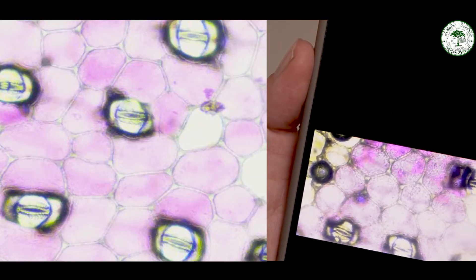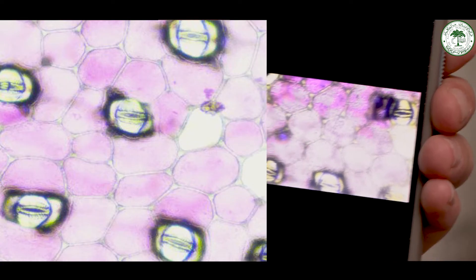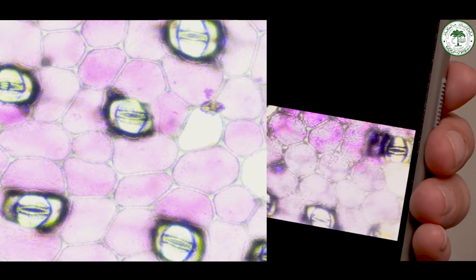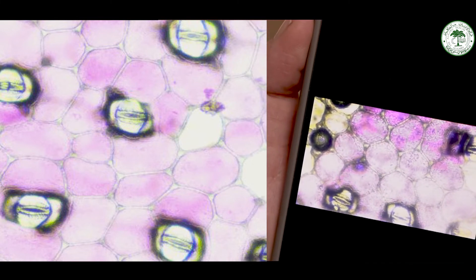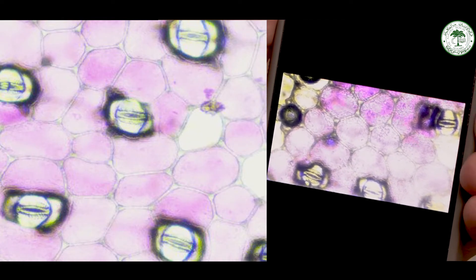As you can see in this image, the cells are in a normal state. This is the image of slide number one with zero molar NaCl solution. Here, the cell contents, which are purple in color, are tightly pressed against the cell wall — no plasmolysis has occurred. This is a normal, turgid cell. We note down the total number of cells in focus and the number of plasmolyzed cells in the table. This next image shows slide number three, in which we poured 0.25 molar NaCl solution. You can see that some of the cells have started to plasmolyze.